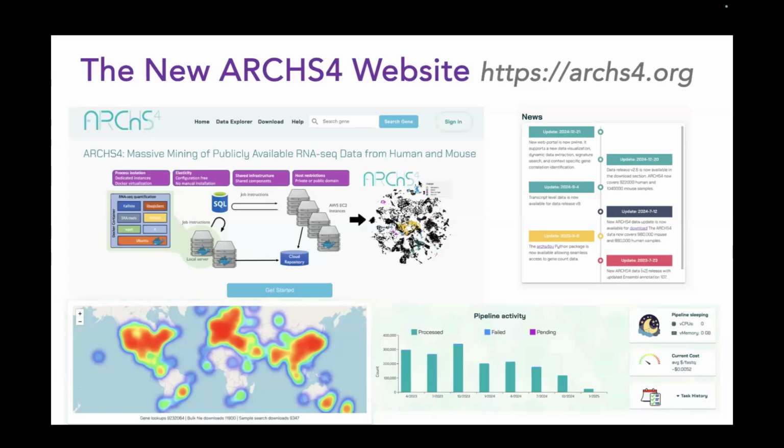And then we also have this pipeline activity monitor, which is especially nice for me because I can just look at the website and I can see the status of the pipeline, if it's processing at the moment, when it looked for the last samples and so on. But you can look at it too. It's a nice feature.